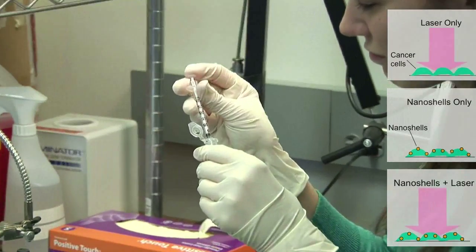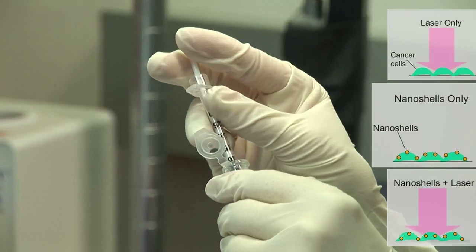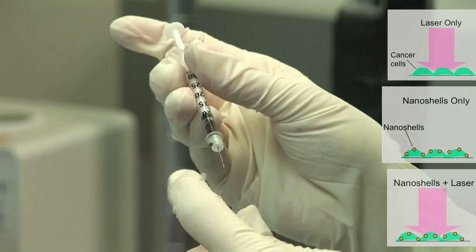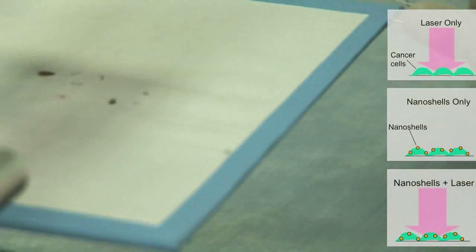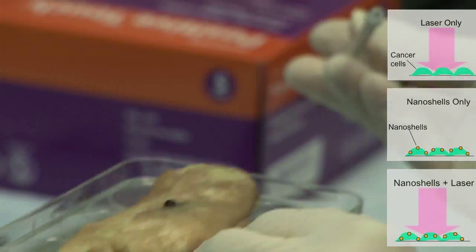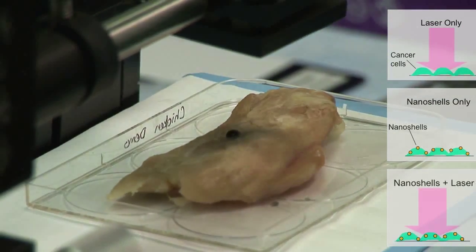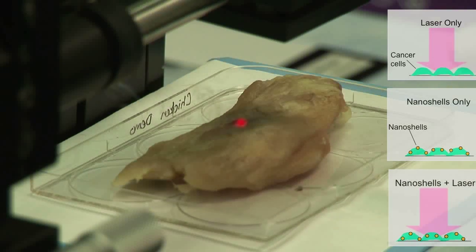I'm going to take 50 microliters of nanoshells to inject into the chicken tumor. I'm just going to insert it right under the skin. It dribbled out a little bit, but that's okay. Now it's really starting to get going and there's a lot more smoke coming off — and it starts to smell quite lovely as well.